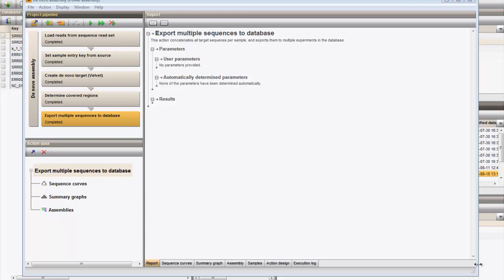For more detailed information on the project pipeline in the power assembly, the project settings, reports, and assembly information, you can check our movies on the power assembly functionality.